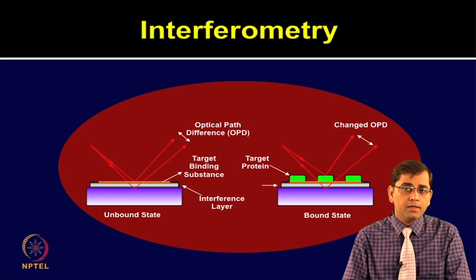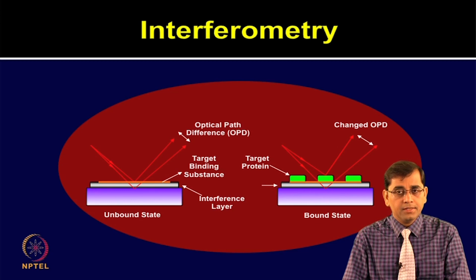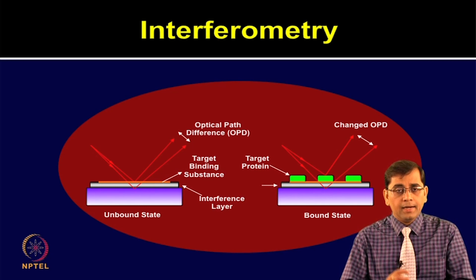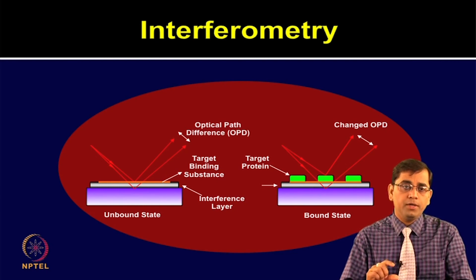In interferometry, the phase difference of wave fronts are transformed into observable intensity fluctuations, which is known as interference fringes. The interferometry techniques relate the optical phase to biomolecular layer density on the surface. The signal is created by additional phase shift or optical path length difference, which is caused by the adsorbate biolayer.